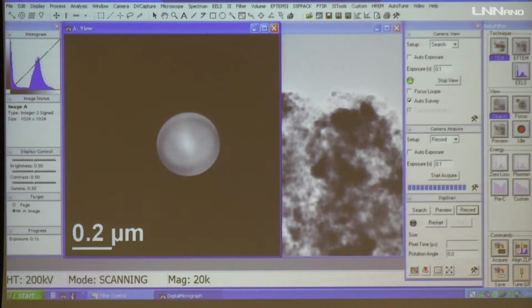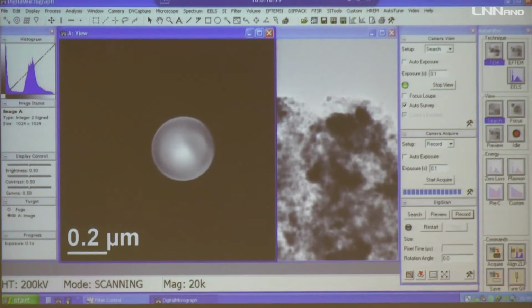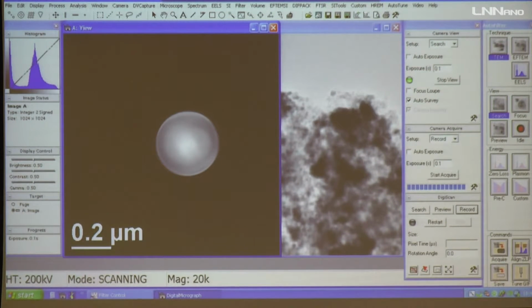You see, this way, you can be rid of some of the aberrations, but for sure, you continue to include many of them in the system, because it's an uncorrected machine. You can't be completely rid of it in this operation, okay? Then I will make it a little bit smaller here.